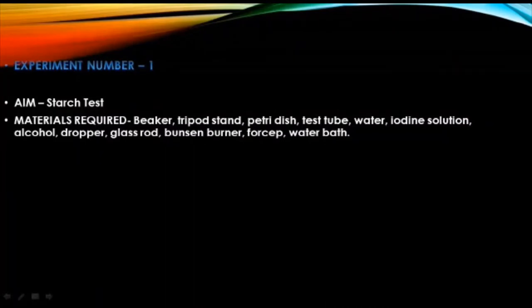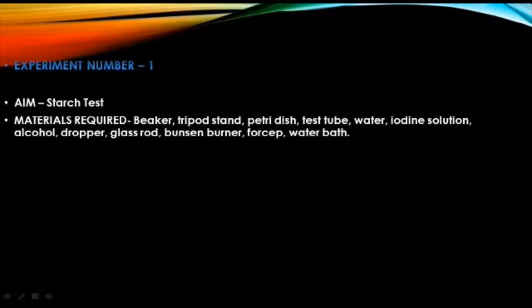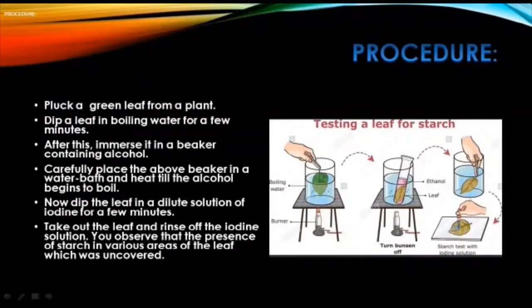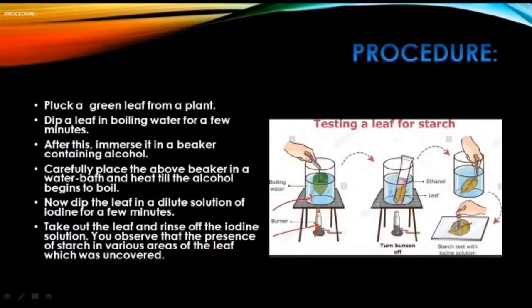The materials required for the starch test are: a beaker, a tripod stand, a petri dish, test tube, water, iodine solution, alcohol, dropper, glass rod, Bunsen burner, forceps, and a water bath. You can see the setup — this is the Bunsen burner, there is boiling water inside the glass container, and we have taken a leaf. Let us read what we have to do for this experiment.